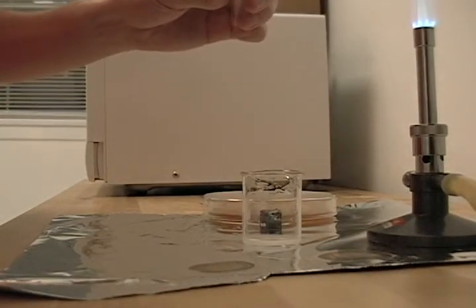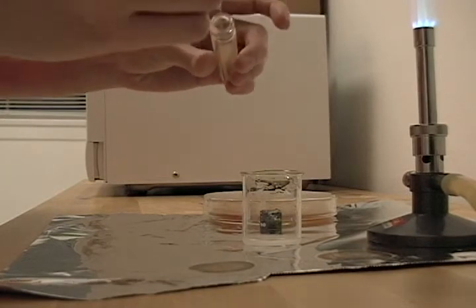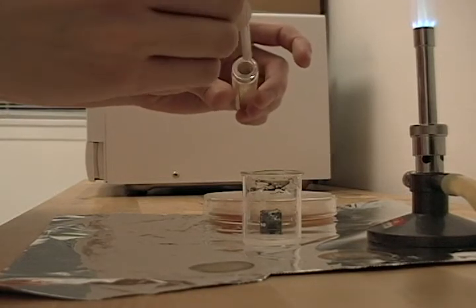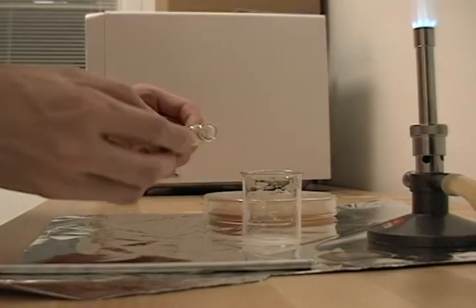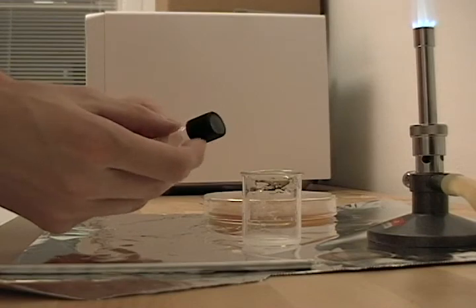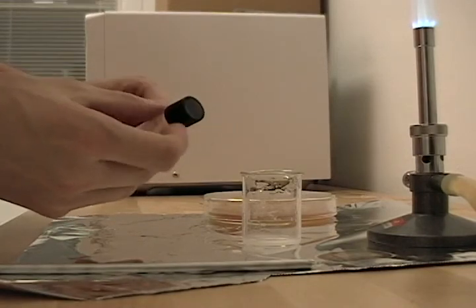Grab some of my yeast mixture and just spread it all around the surface of the slant here. Recap the lid very loosely on the slant and let this incubate for several days.